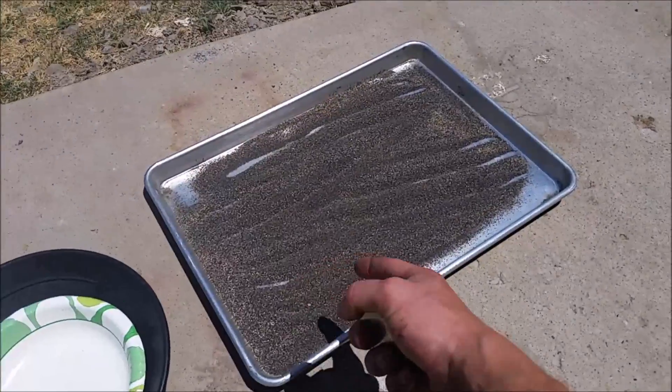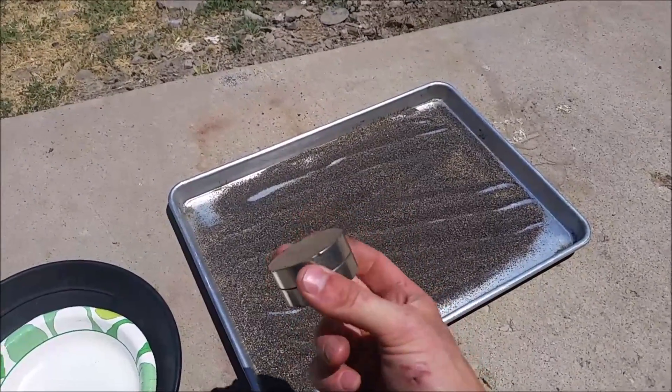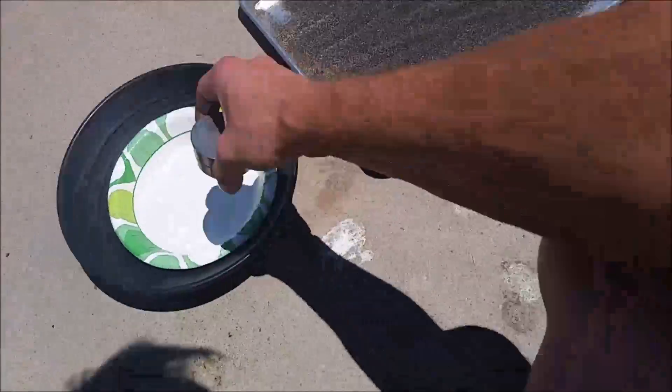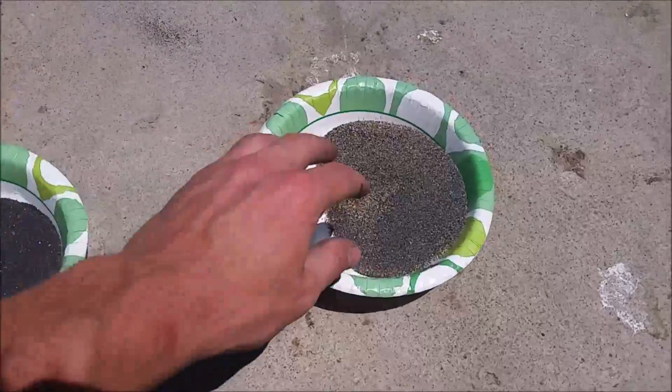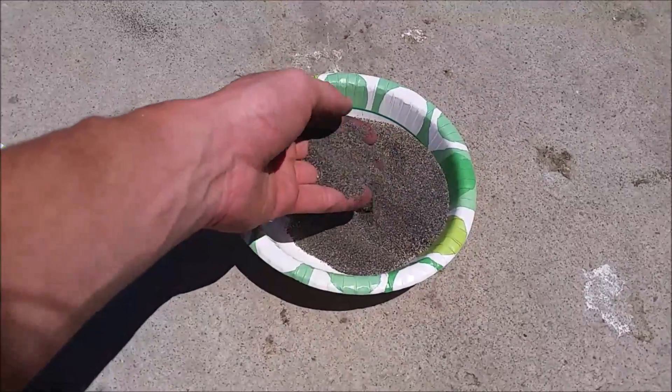Now this is thoroughly dry, so I'm gonna go ahead and pull the magnetic iron out with this magnet. Okay, there we are — all the magnetic iron on this side, and everything else on this side.